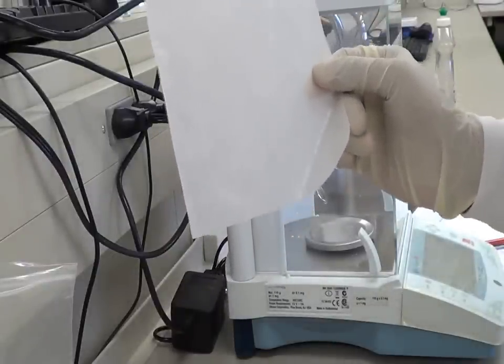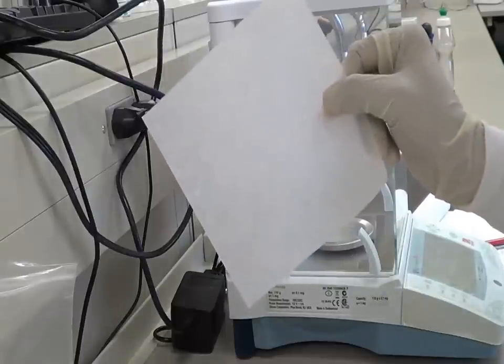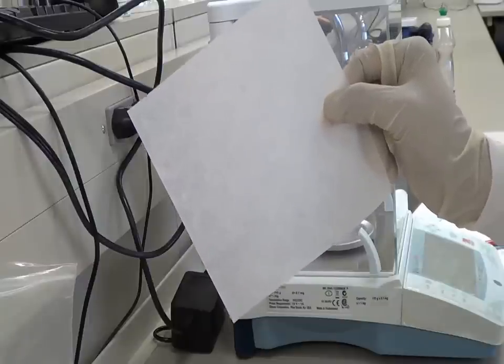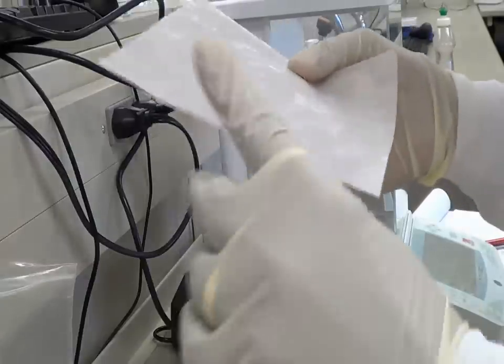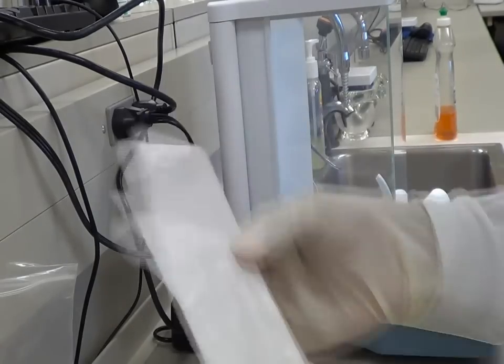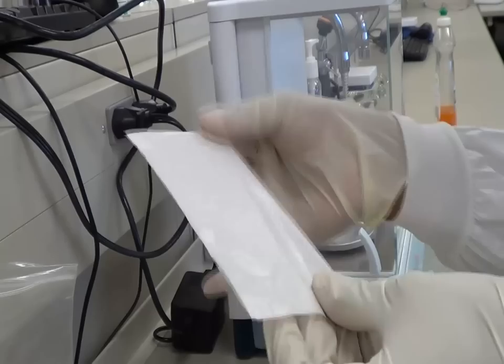This weighing paper is actually too big if you want to weigh like 100 mg or any grams. So what you do is you just fold it and tear it apart into four pieces, four equal pieces like this.